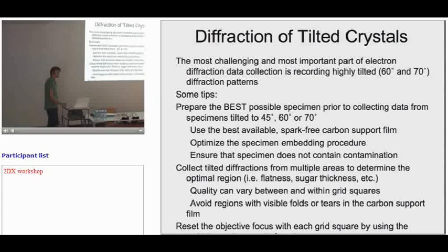What is the concentration? I use 4% to pick up, and then either water or 0.5% with the loop, depending on how humid or dry it is that day. And I've tested everywhere from 1 to 10%, and 4% consistently gives the best embedded specimen.